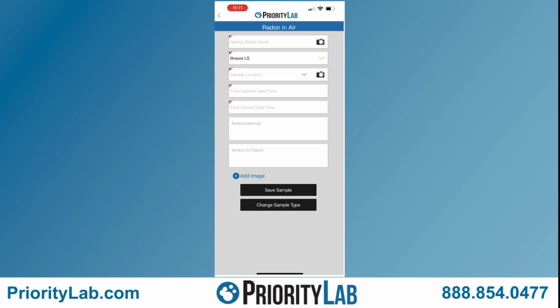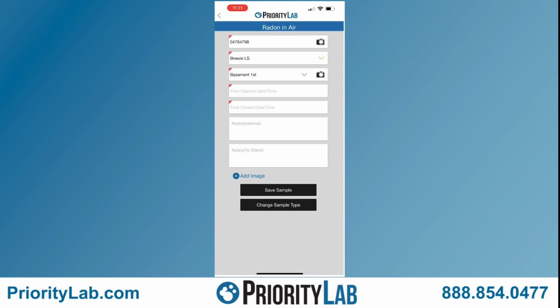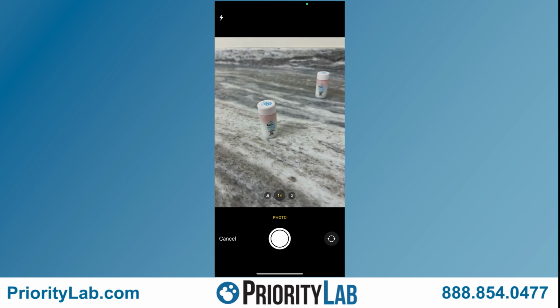We will first scan in the testing media serial by lining up the crosshair on the Breeze LS QR code. The Breeze LS will automatically populate for the device type field. Next, for the sample location, we will either use the drop down to select the room we have placed the device in, or simply click into the function and type out the appropriate sample location. We will then take a photo of where we place the device.